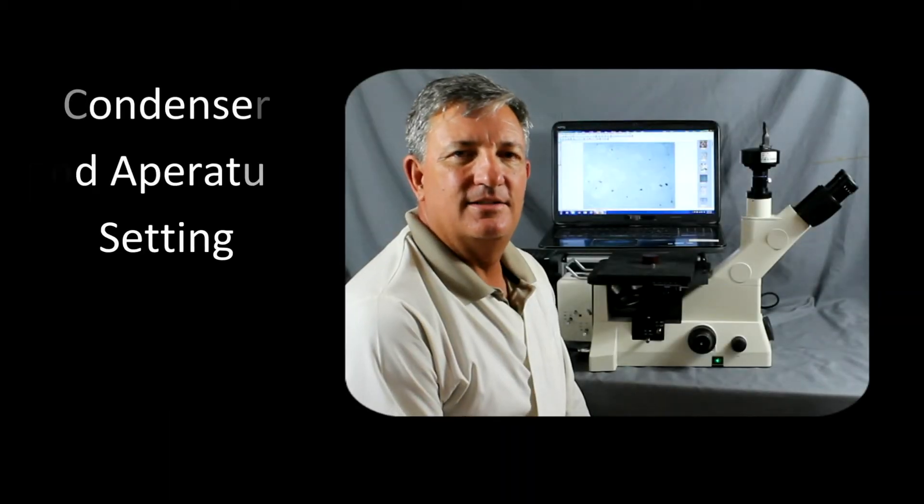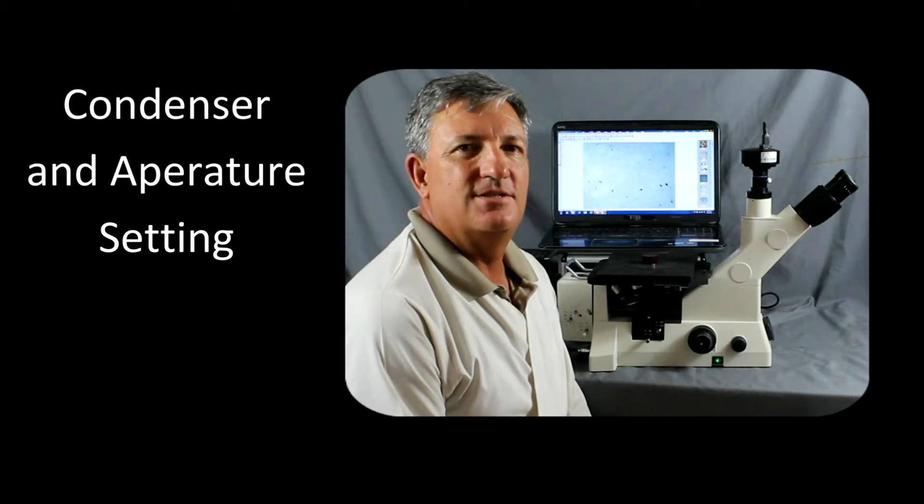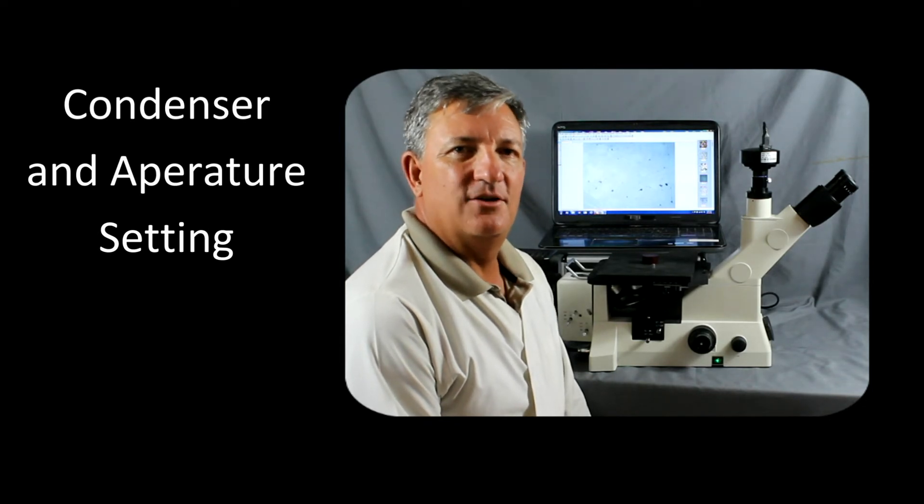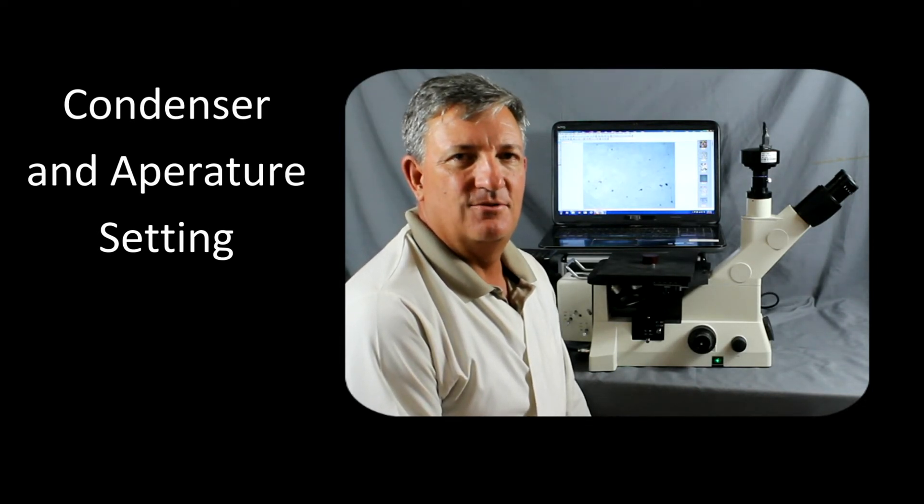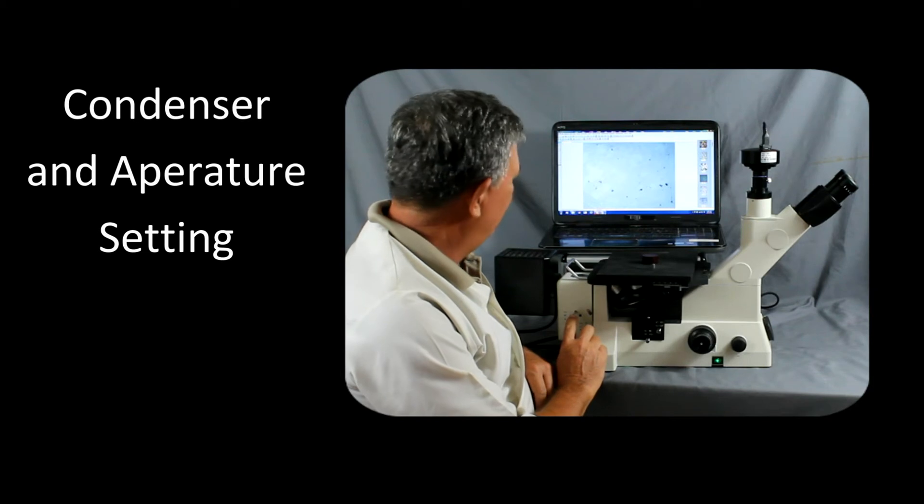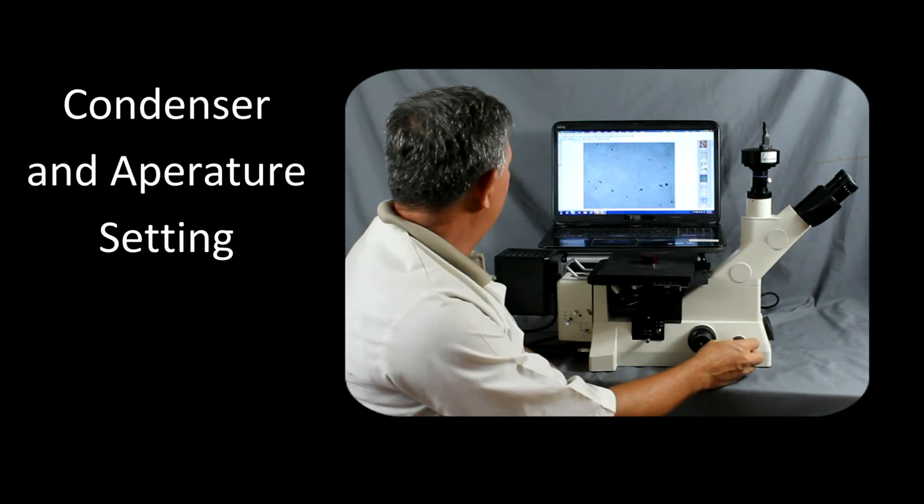After we've optimized the light path, what we want to do is we want to now defocus or diffuse the light. We can do this a number of ways. One is we can add a ground glass filter or rotate the turret to the ground glass turret. We can also use this condenser lens adjustment here. By pressing this in, that will defocus the light or make it a little bit more uniform.